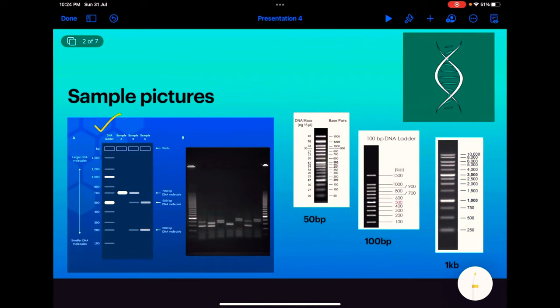Here we have some sample pictures. Now one thing you need to know about is DNA ladder or a DNA marker. It is a solution of DNA molecules of different lengths, and it is loaded along with the samples to estimate the size of unknown DNA molecules. There are different types of DNA ladders with different lengths, for example a 50 base pair ladder, 100 base pair ladder, and a 1kb ladder.